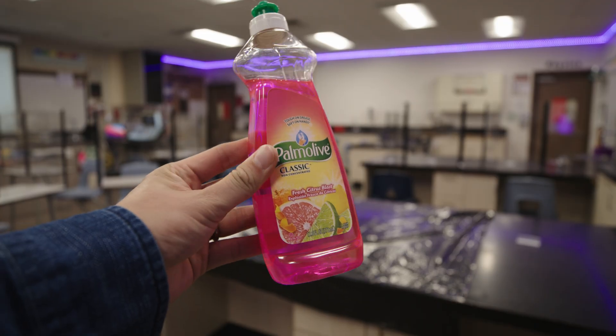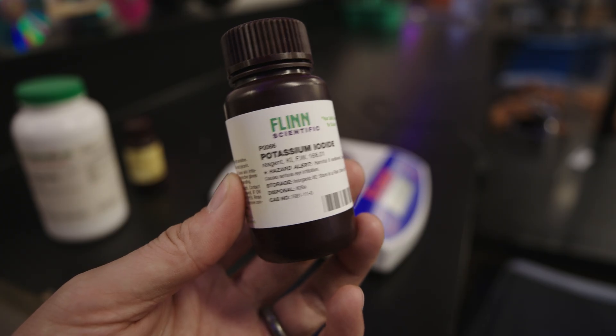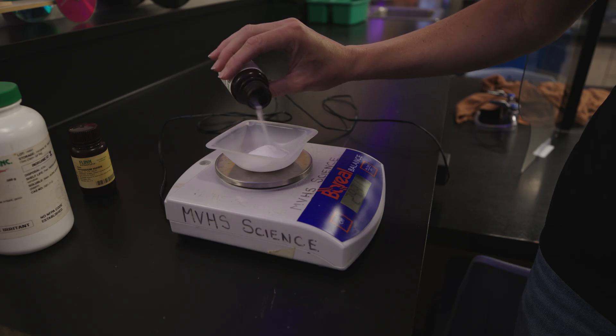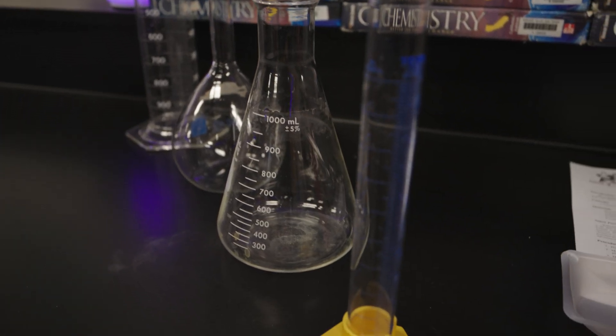Some basic materials and chemicals you're going to need for this experiment include dish soap, food coloring, hydrogen peroxide at 30%, some potassium iodide — or you can use sodium iodide. You're going to want some beakers, graduated cylinders, Erlenmeyer flasks, and some different containers that will make this toothpaste experiment a little bit more fun, and you can vary that with your students.